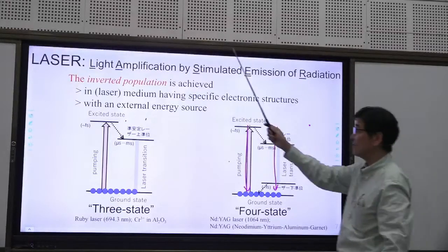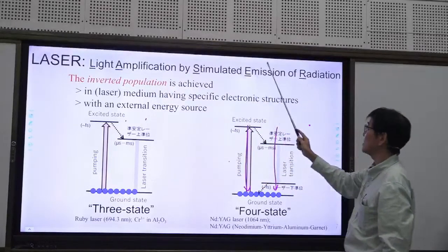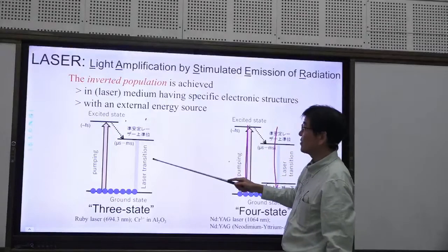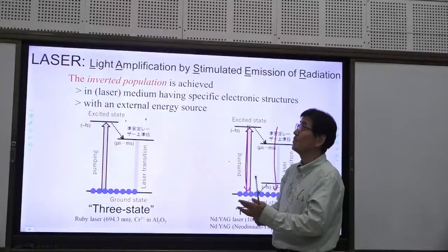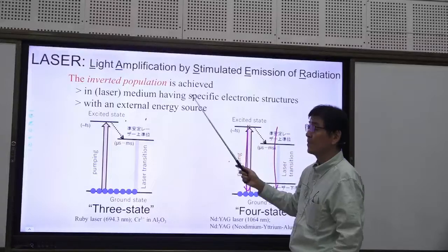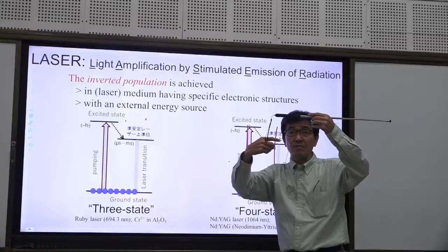The laser is the abbreviation of light amplification by stimulated emission of radiation. In the laser box, inverted population is achieved, and light is irradiated to the inverted population.